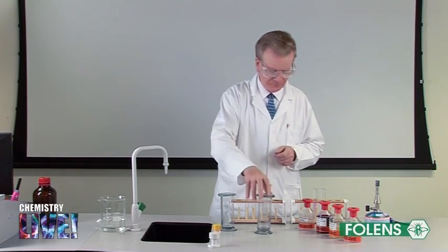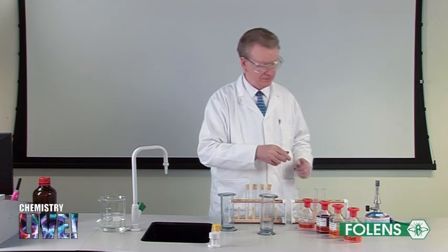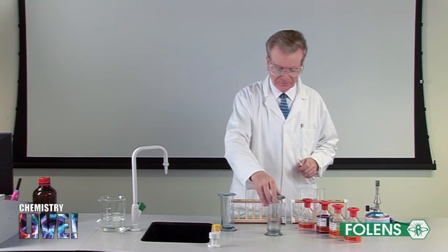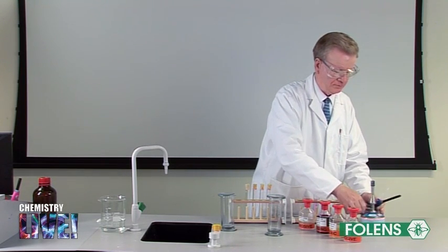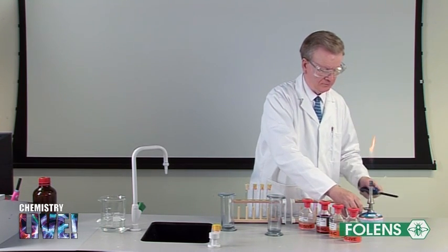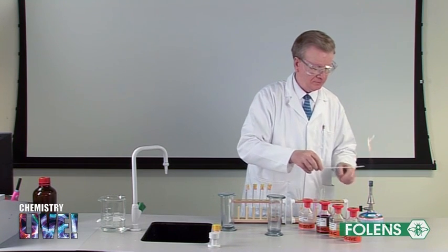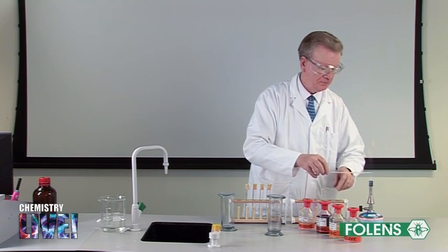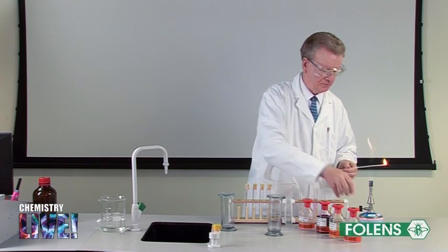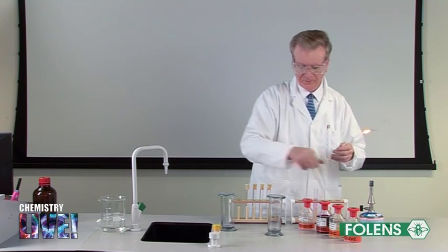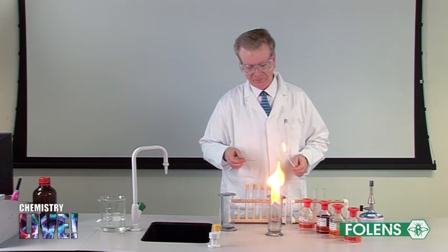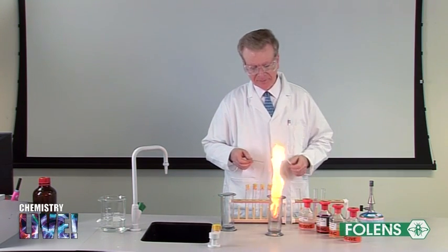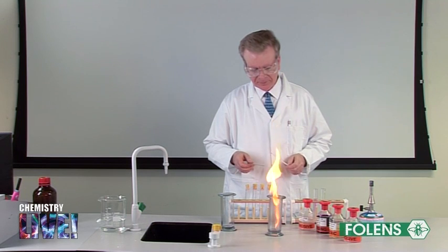We now investigate what happens when we burn ethene. Remove the lid from one of the gas jars and use a lighted wax taper. Apply a light to the mouth of the gas jar. Note that the gas burns with a luminous flame.